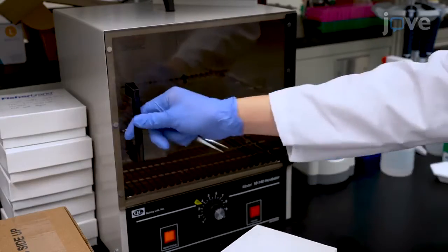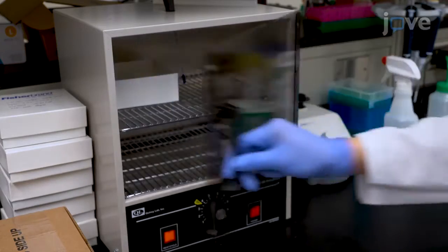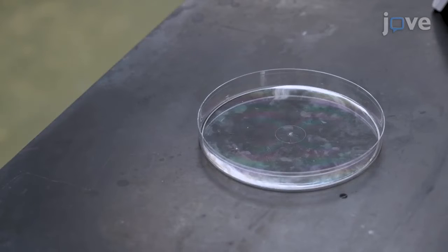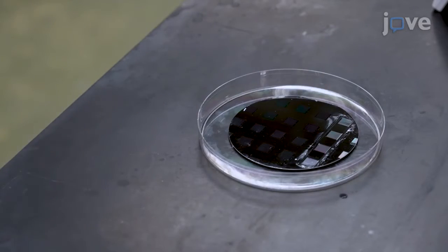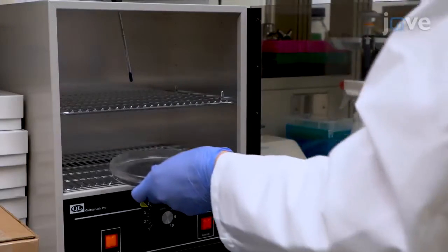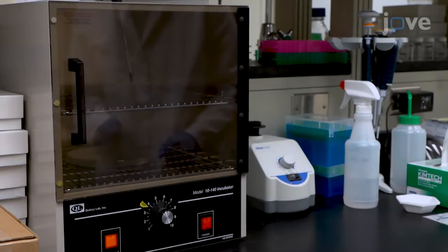Incubate the cover slip in either an oven at 60 degrees Celsius for 1 to 2 hours, or at room temperature overnight. To prepare a micropatterned substrate, place a patterned silicon wafer inside a circular 150 mm diameter by 15 mm height petri dish, and pour degassed PDMS onto the wafer. Solidify the PDMS in an oven at 60 degrees Celsius overnight.